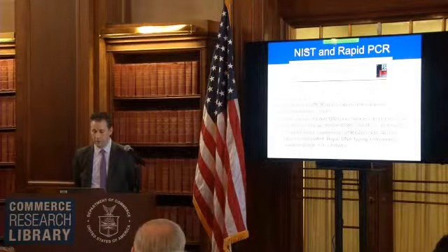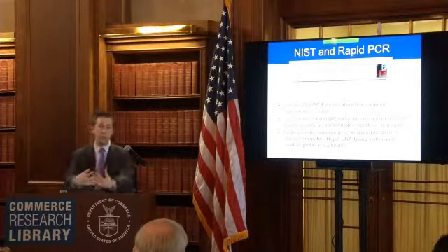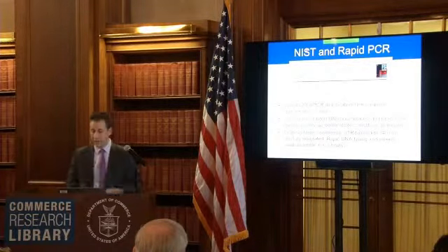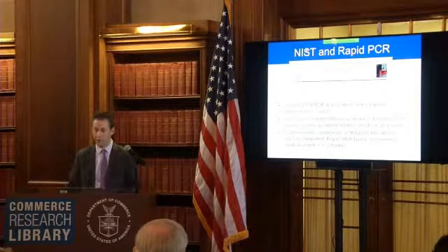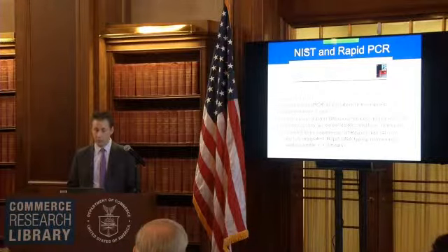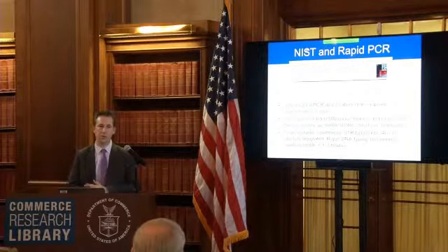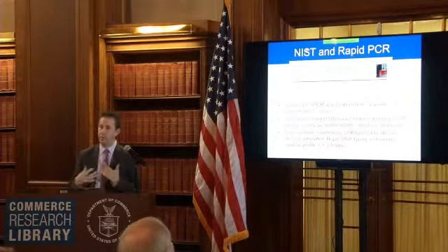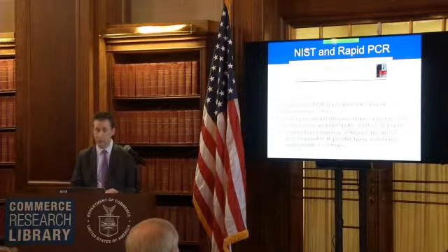about 2008 or before. So some of the work that I did in my laboratory was working with faster polymerases. That's the enzyme that makes the complementary strand, and looking at faster heating and cooling methods. We reduced this from 3 hours down to about 36 minutes. So we published this, and some of the commercial entities like Life Technologies, Thermo Fisher, and Promega have taken that on. And now the commercial kits that are out there, there's one that works in about 40 minutes, and some of the other ones have been brought down to about 90 minutes or so.